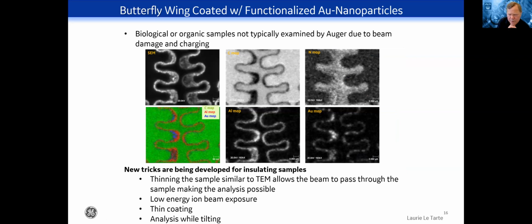A few years ago, we were doing research, and understanding sensing through butterfly wings was an item of importance. So we needed to figure out ways of replicating the butterfly wings, coating similar structures, and verifying the presence of the coatings that were anticipated.